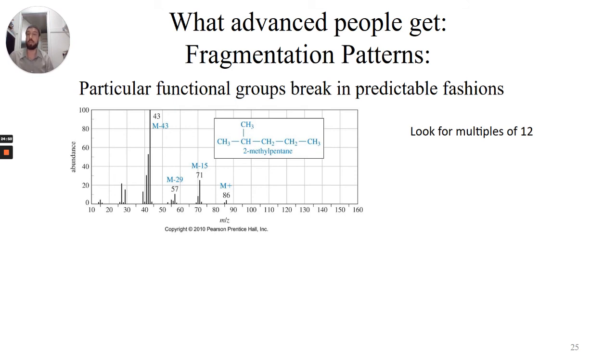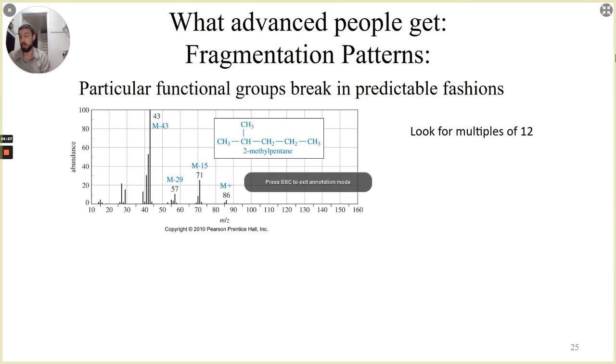So I would go through and look at this. We've got a lot of stuff already labeled on this, but let's walk through our directions. The first thing we said we wanted to look for was the M+.